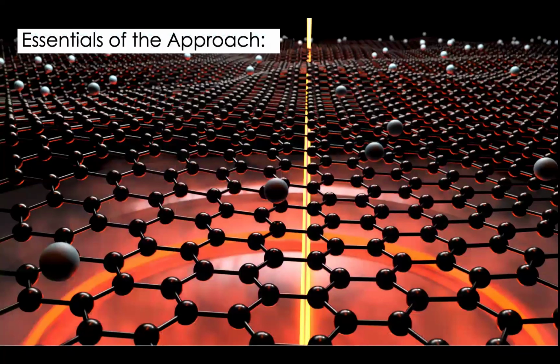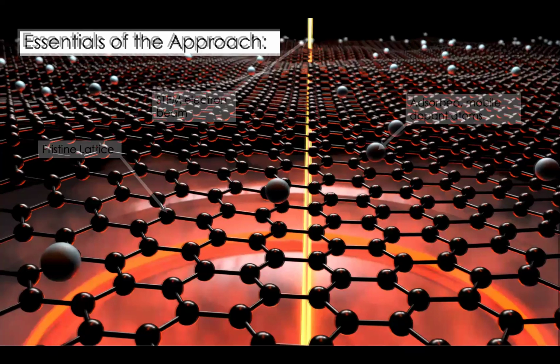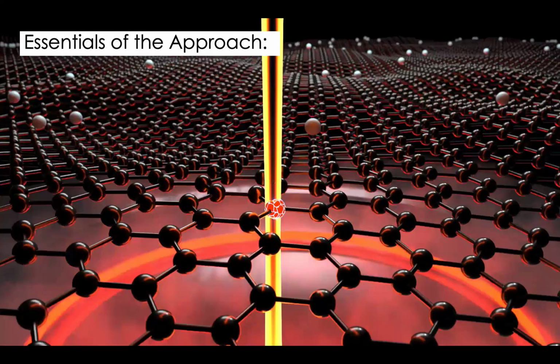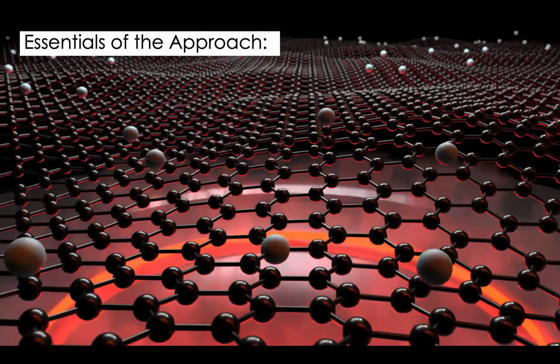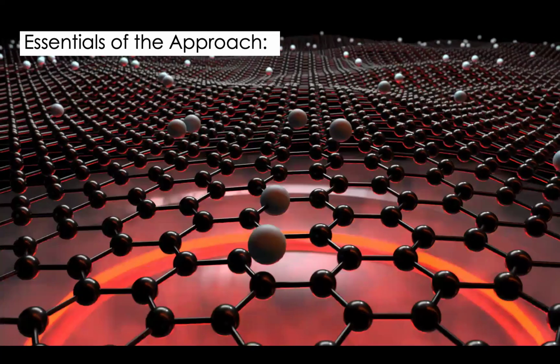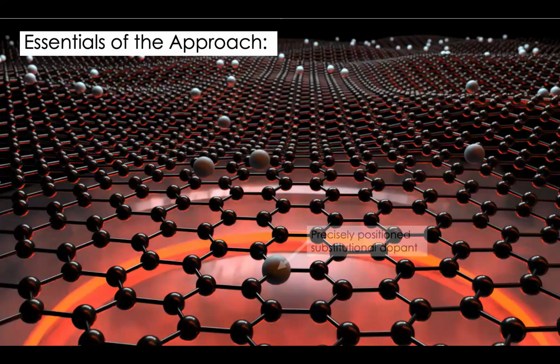And we came up with this approach where we've got this electron beam over there. We've got a pristine lattice, just one layer of it, and maybe a few adsorbed mobile atoms on the surface. We can take this beam and scan it around. Again, I'm controlling it with my own electronics, and I'm saying, okay, dwell on this little atom until it knocks out. And then we can stay there and keep looking at it until we see that it's filled with a dopant atom, right? And so with this kind of technique, we can more or less precisely position atoms within a few atomic spacings of where we wanted to put it in the surface.